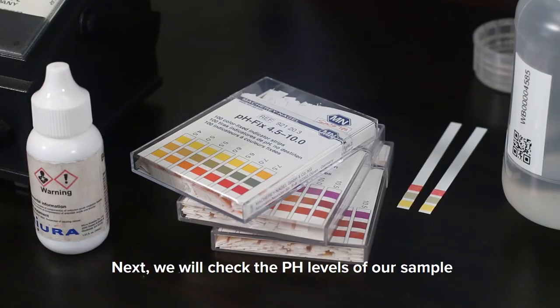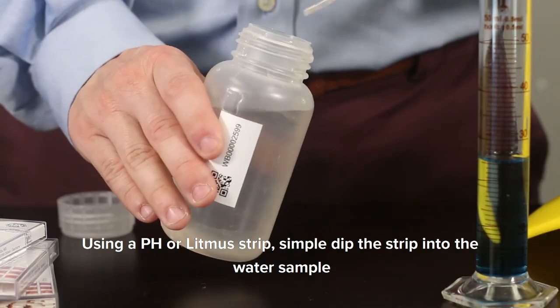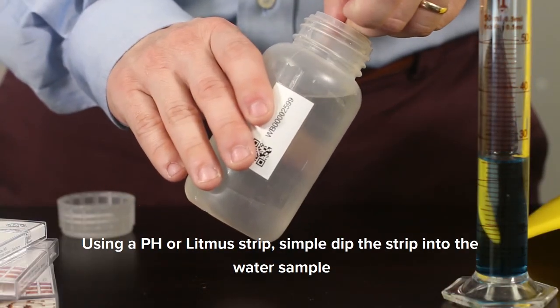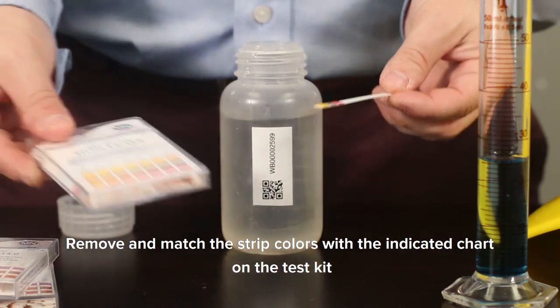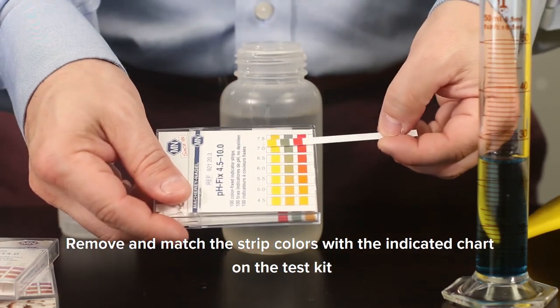Next, we will check the pH levels of our sample. Using a pH or litmus strip, simply dip the strip into the water sample. Remove and match the strip colors with the indicated chart on the test kit.